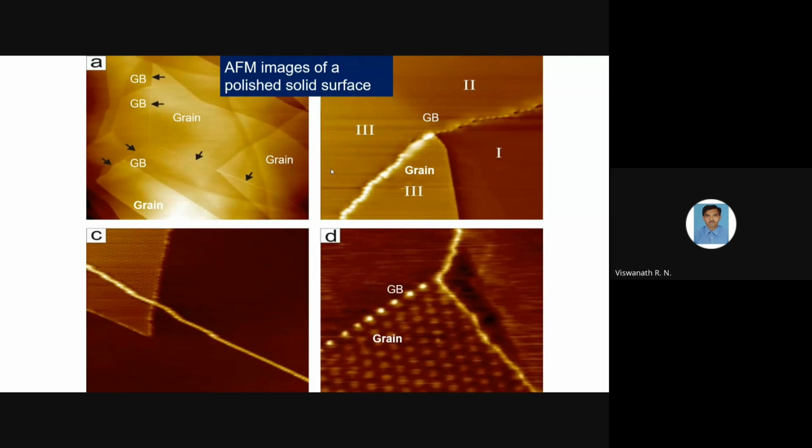If you look at the same material with an atomic force microscope, you will see the quality is still finer. You see the separation between atoms. You can nicely see the atomic configuration in air. That is why AFM has advantages compared to other techniques. But it's difficult to get this type of information, so it's for when you need a good quality material.